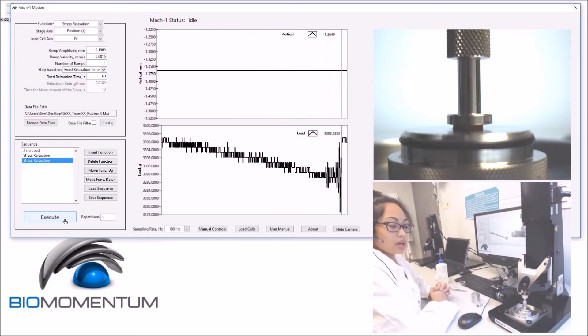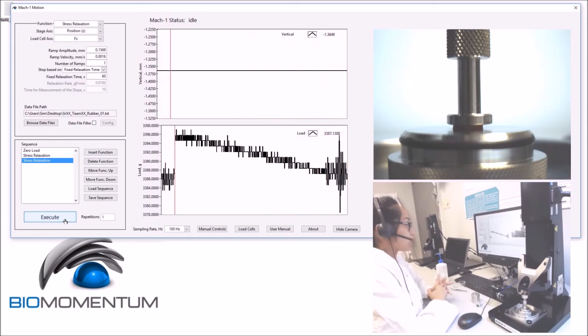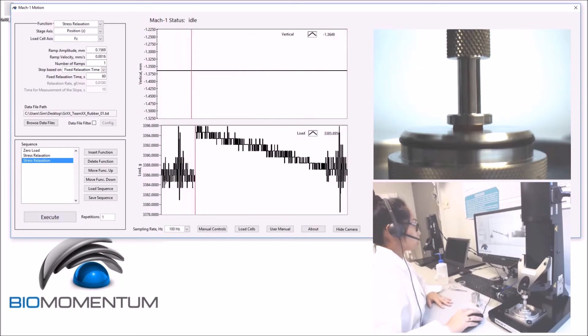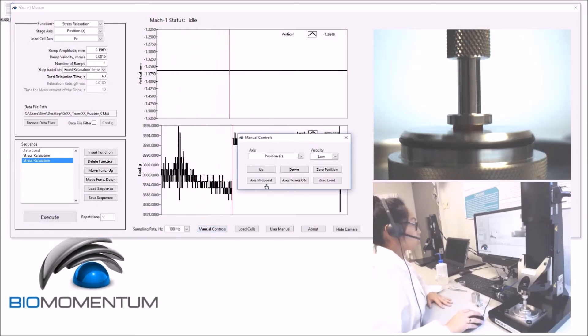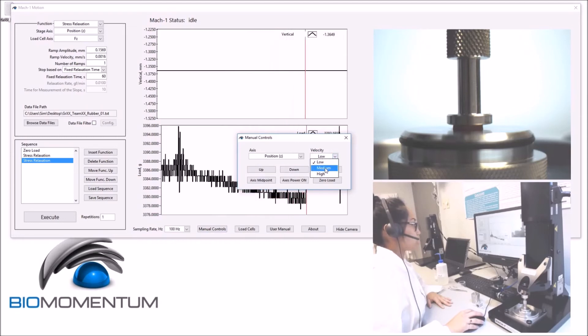Now, using manual controls, raise the stage to approximately 50 mm above the sample holder using medium speed.